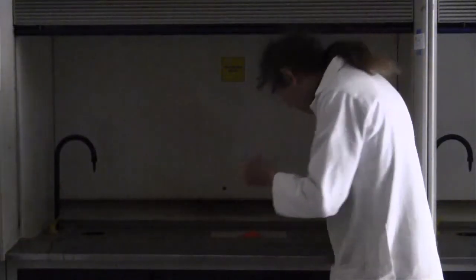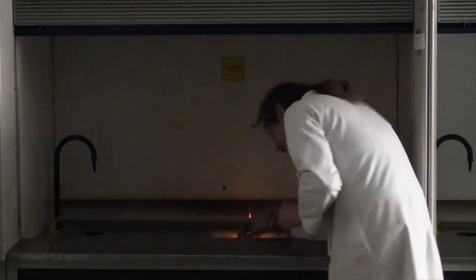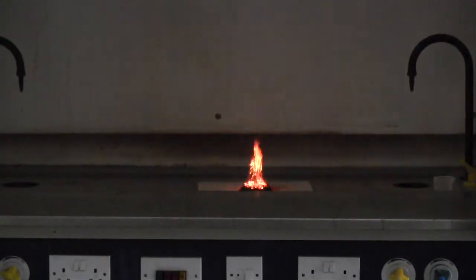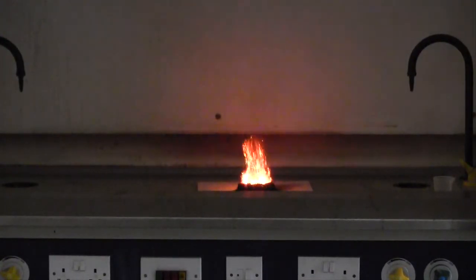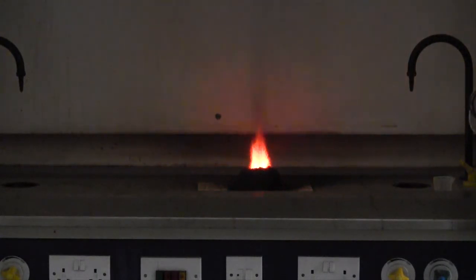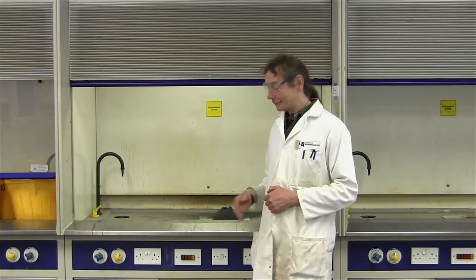Now we have it in the fume cupboard, I'm just going to drop some alcohol or acetone on it and set it on fire and we'll see what happens. Did it fizz or did it bang? No, it fizzled and expanded.